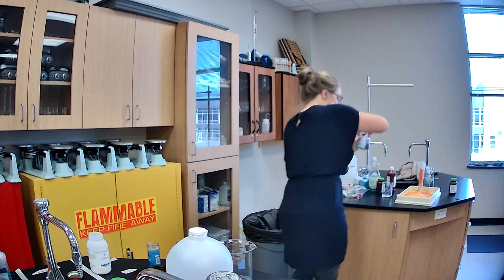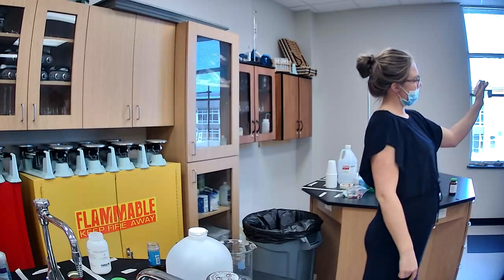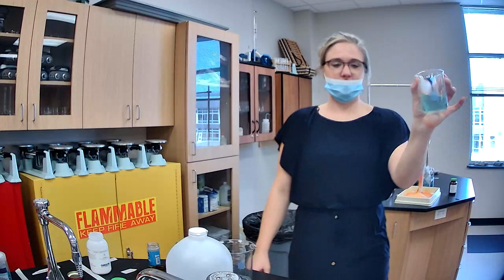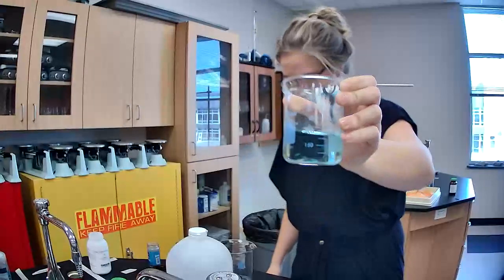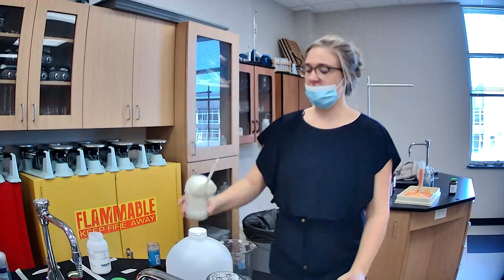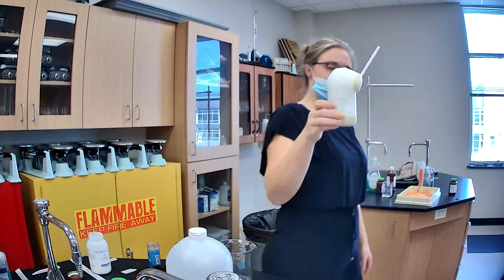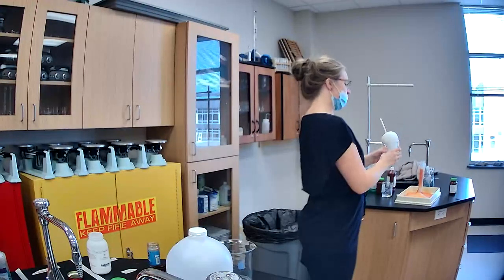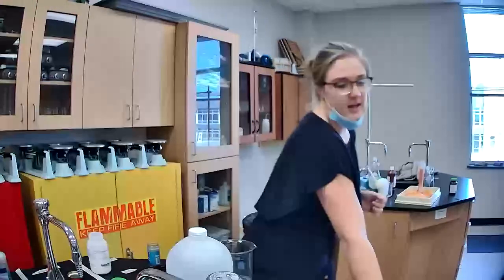Okay, look at our guy now. Looks like a galaxy. The yeast is overflowing even more. Yeah, look at our yeast. It looks like a milkshake. Okay. So, here's what we're going to do now.